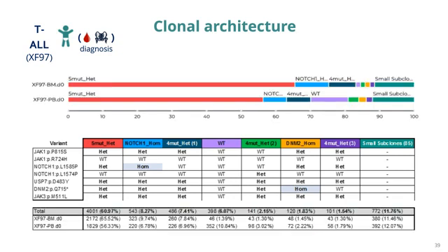So if we look at how is the distribution of these different clones, now in the lower bar you have the peripheral blood sample, and the upper bar corresponds to the bone marrow sample. And what we can see is that there is, first of all, a major clone in red. This one comprises more than 50% of the cells, both in bone marrow and the blood. And this clone is heterozygous for 5 of the variants. Then we have 3 other smaller clones that are present at a frequency of less than 10%, and they are heterozygous for 4 of the variants in different combinations. These smaller clones are also present both in the bone marrow and blood, but at slightly different frequencies.